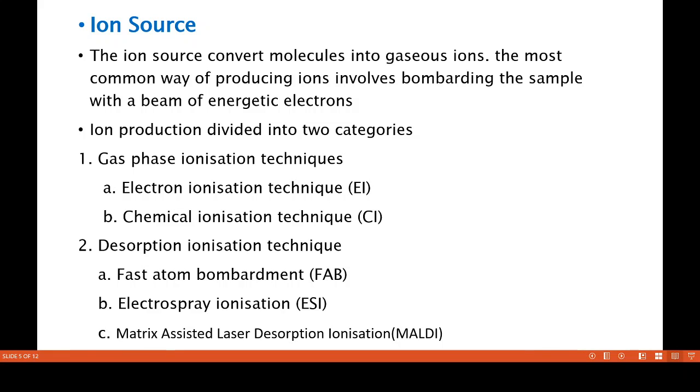While in desorption ionization technique, these three techniques are involved: fast atom bombardment, FAB, second electrospray ionization, ESI, and the last matrix assisted laser desorption ionization, that is MALDI.